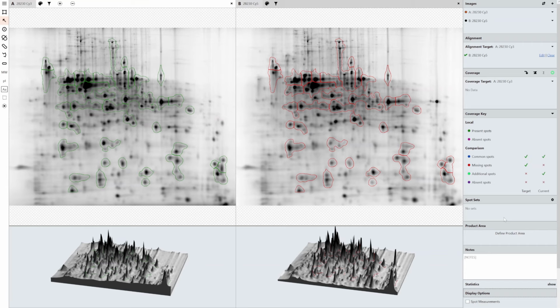Hello everyone. So today I'm going to be guiding you through the image alias, the image nickname function within SpotMap, to allow you to append different pieces of information to your image, rename them, and I'm also going to be going through the image editing function that we've got within the software as well, and various points where we can add notes. Now, I'm using the standard version of the software here, where we have a few places that we can include kind of image metadata, experimental metadata.